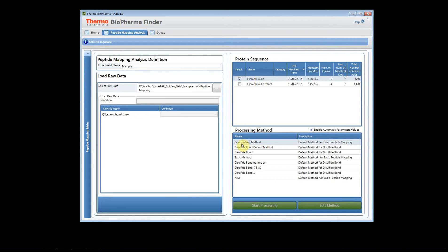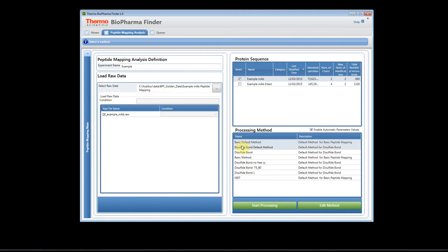Now we have some canned methods. We have two canned methods that we provide with the software and as you build your own methods you can save the methods and those will appear here on the list.